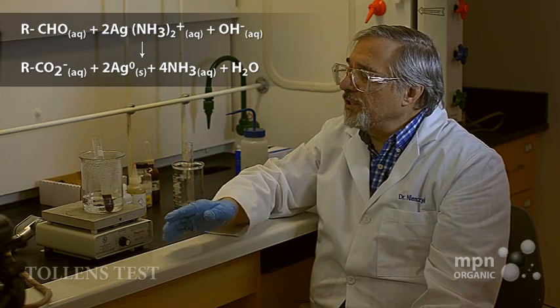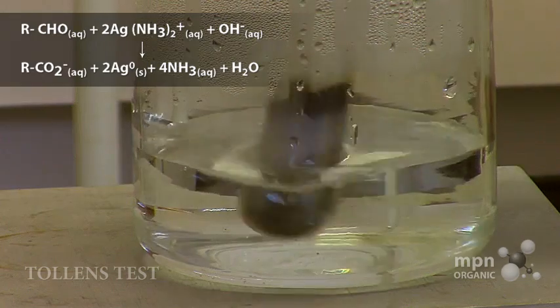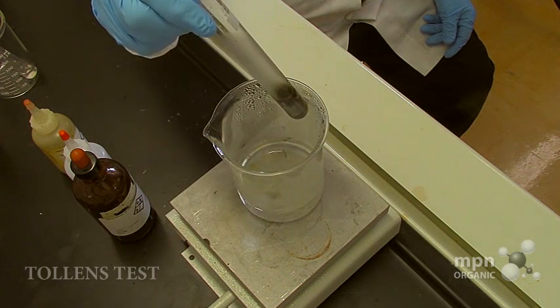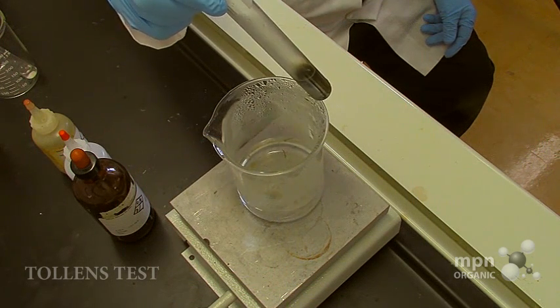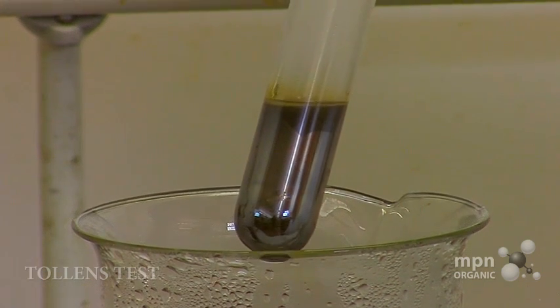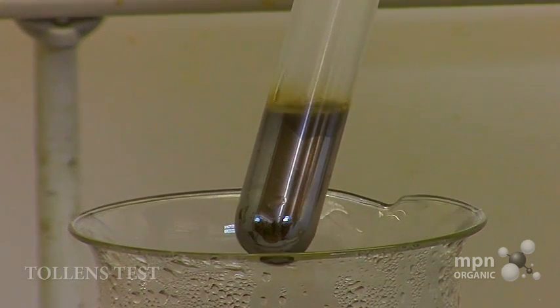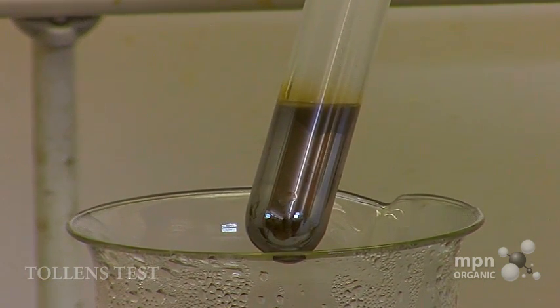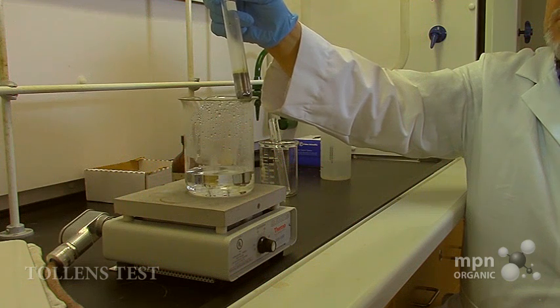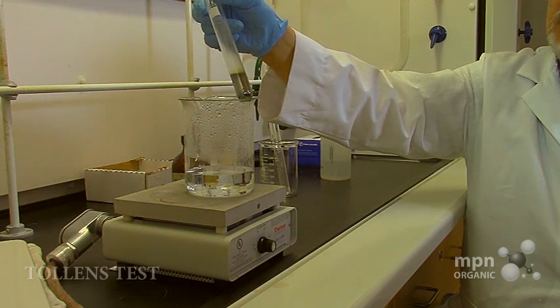What you'll notice is the formation of a very nice silver mirror coating on the inside of that test tube. You see that? This is also called, besides the Tollens test, the silver mirror test. You can see that the silver mirror is forming.